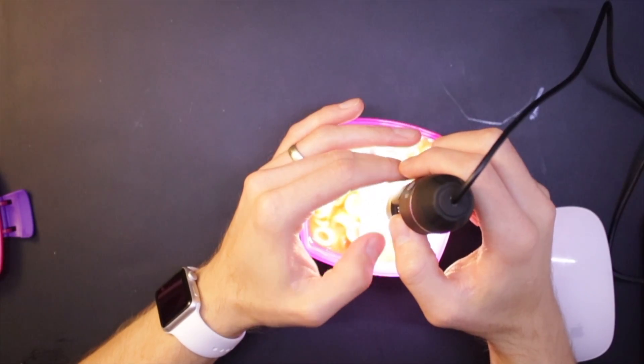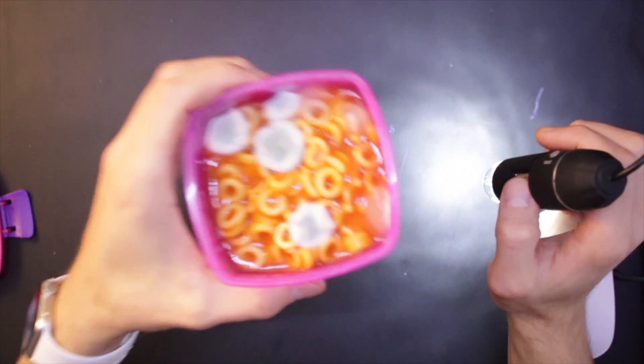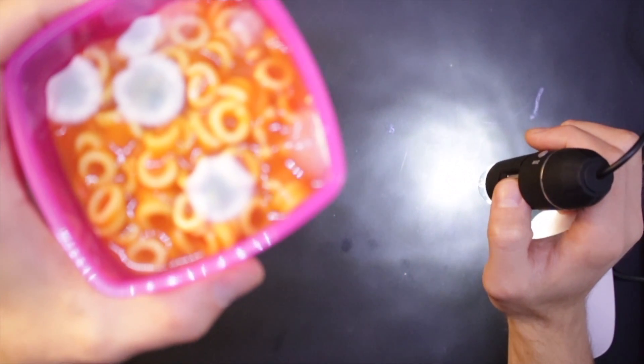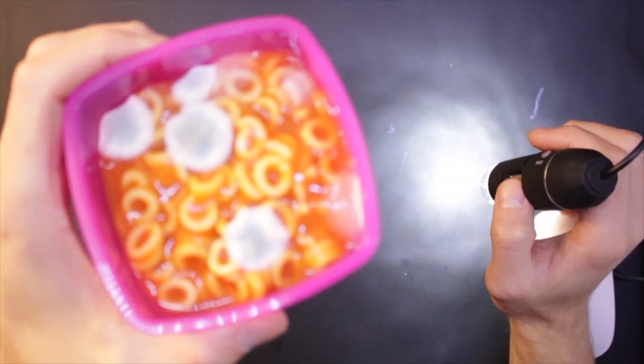Let's have a look what a spaghetti hoop looks like up close. It looks translucent, which I didn't really expect. That might be the effect of the sauce on it. And also very dotty, kind of like the watch strap. They don't look dotty when you look at it like that. But when you look at it through the microscope, you'll see a lot of black dots in there.